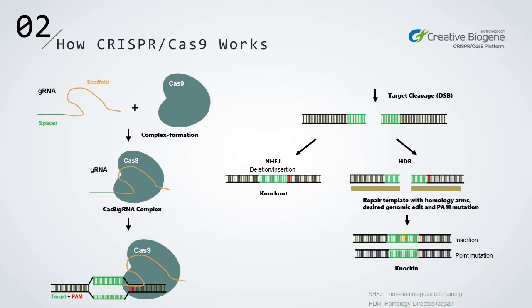However, DNA can get specific nucleotide change, ranging from single nucleotide changes to large insertions, such as the addition of fluorophores or tags, by homology-directed repair. In order to perform gene editing via homology-directed repair, a DNA repair template containing the desired sequence must be delivered to the cell, along with guide RNA and Cas9. The repair template must contain the required edits, as well as other homologous sequences, called left and right homology arms, upstream and downstream of the target.